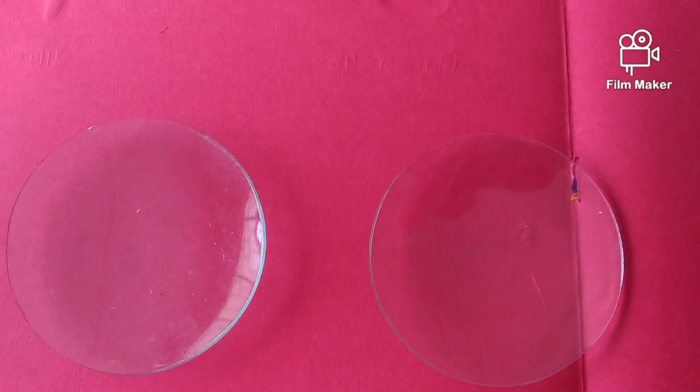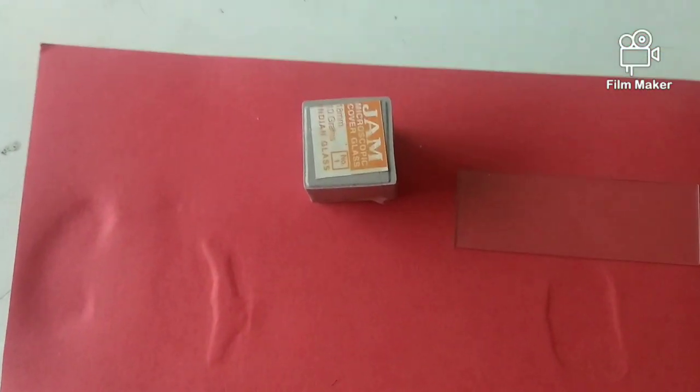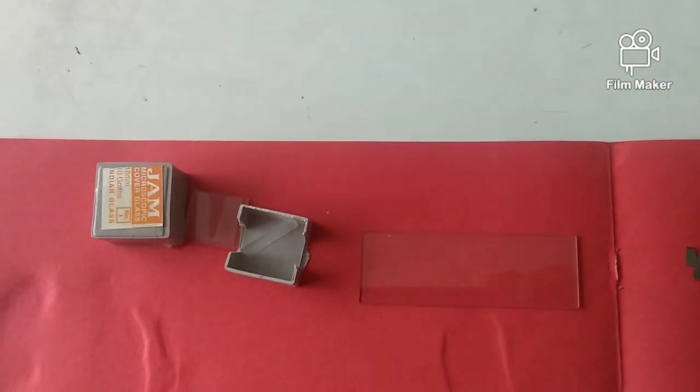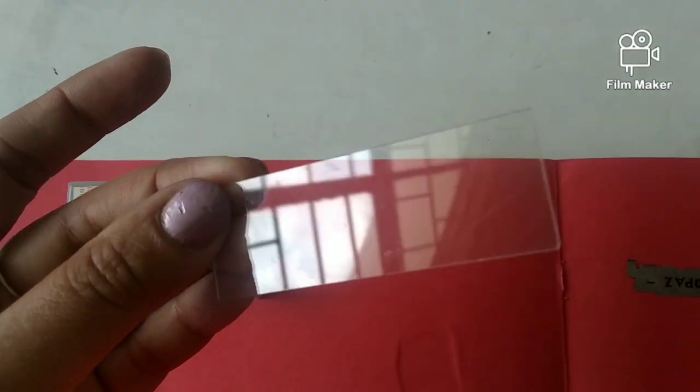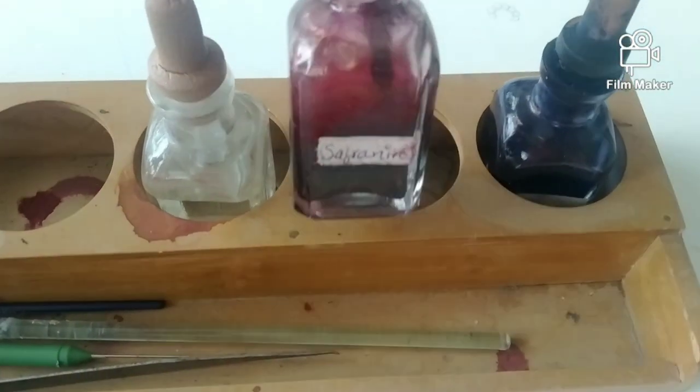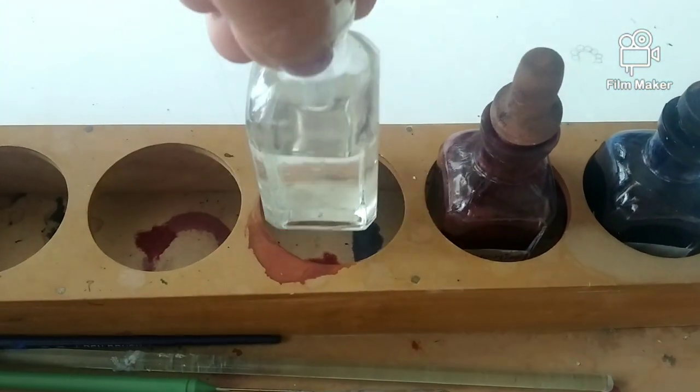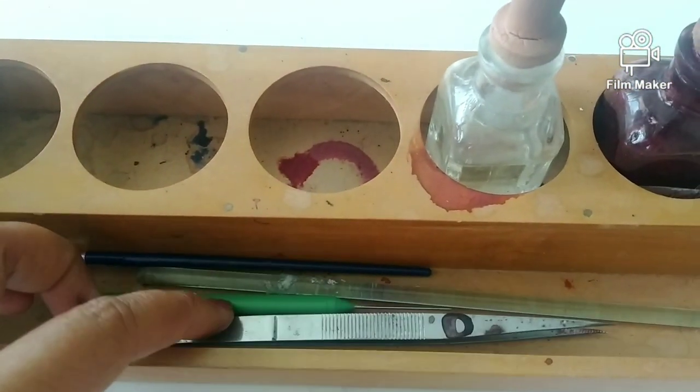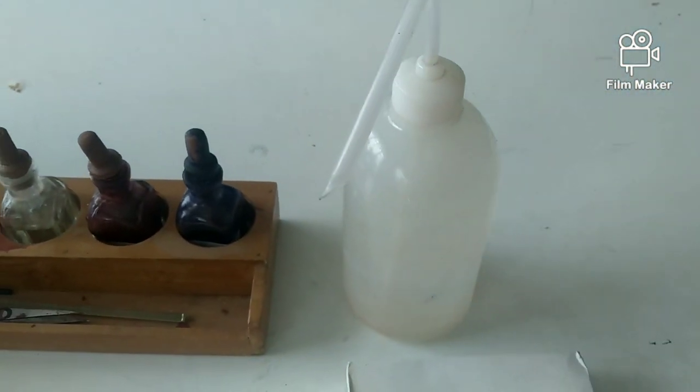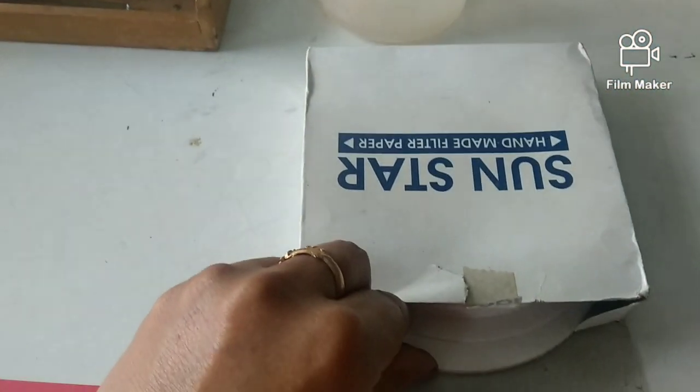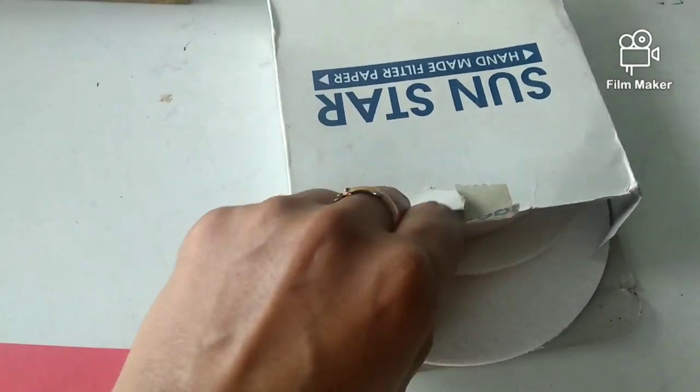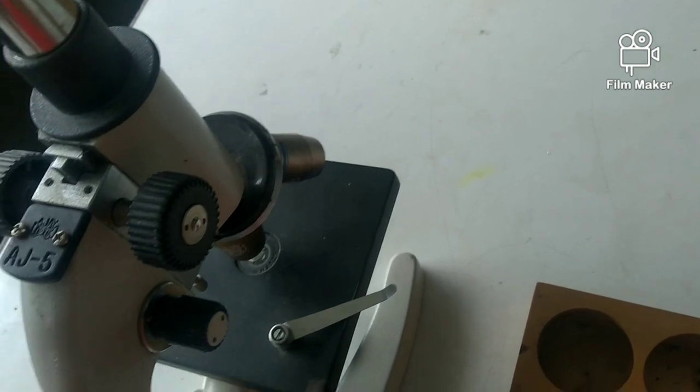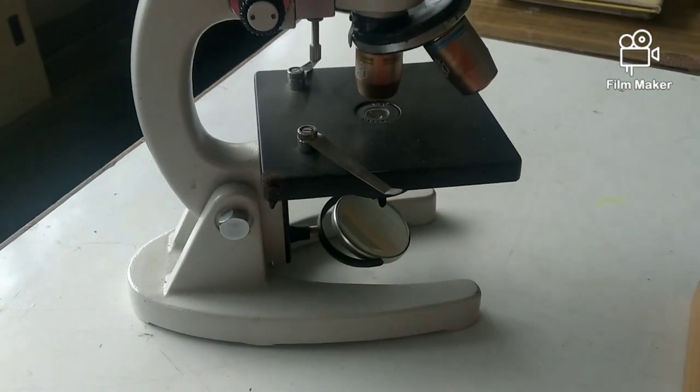These are the watch glass which we need, and this is a cover slip. These are very thin and delicate so we should handle them very carefully. This is a glass slide, safranin dye, glycerin, a transparent liquid, and we also need a brush, needle, forcep, water bottle with water in it, blotting paper, and the most important equipment, the microscope, which will magnify the specimen.